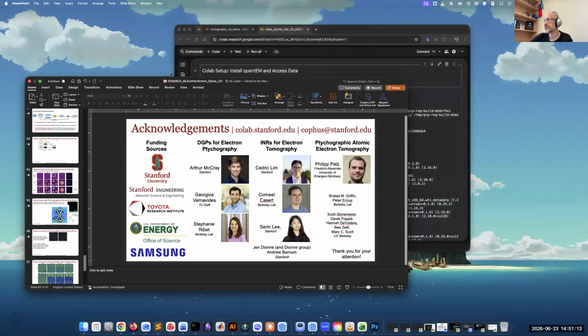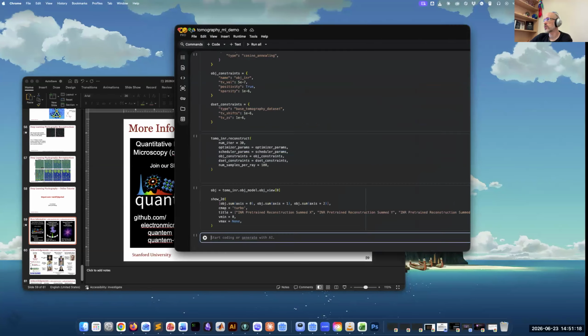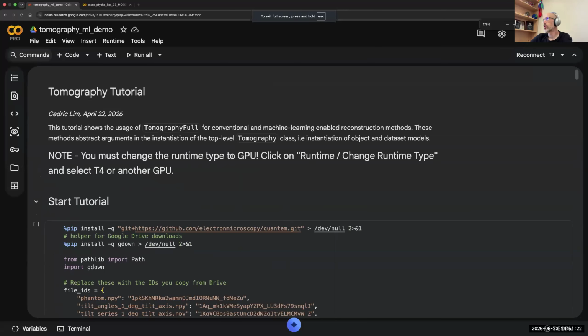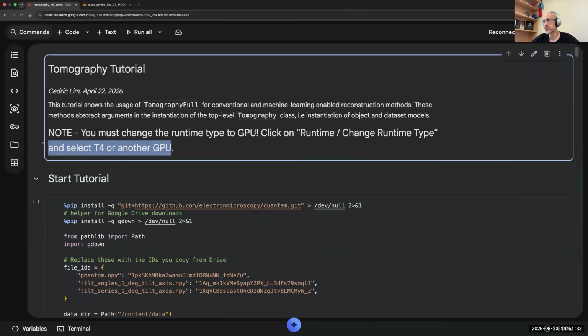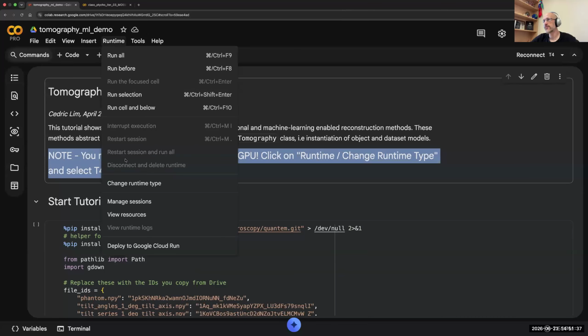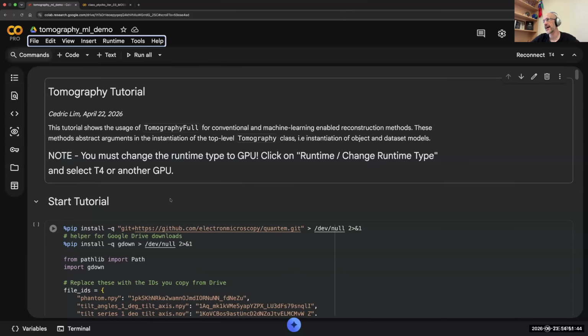I will very briefly now flip over to the notebooks and just quickly show you what's in the notebooks here. This is Google Colab. And if you want to, hide the top bar, have more screen, zoom in, I recommend tutorials on Colab when you don't want to install anything on your machine here. For this tutorial on the INR, you definitely want to flip your runtime over to being at least a T4 GPU, although it'd be better if you pay Google to use the A100. It'll be a lot faster here.